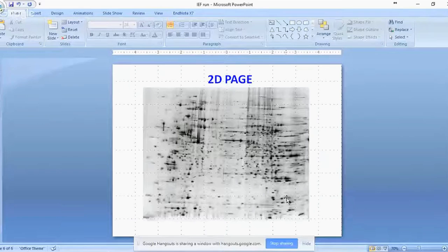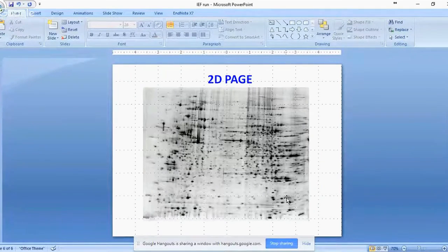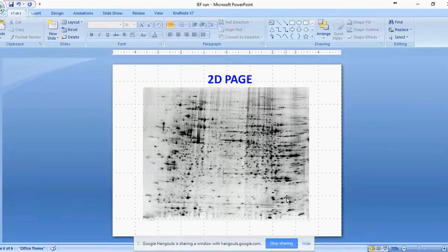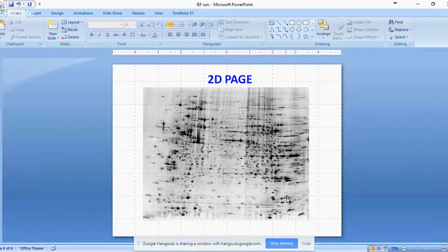Once we scan the 1D gels, I will show how to look at a 2D gel. This is a scanned image of a 2D gel that we have already run before, and this is how a good 2D gel looks like. You can see there are a lot of spots — a lot of proteins are visible.